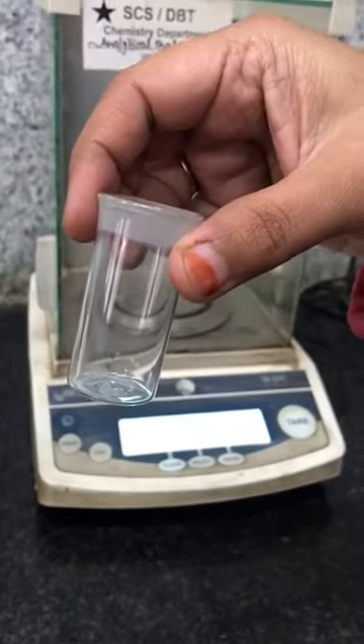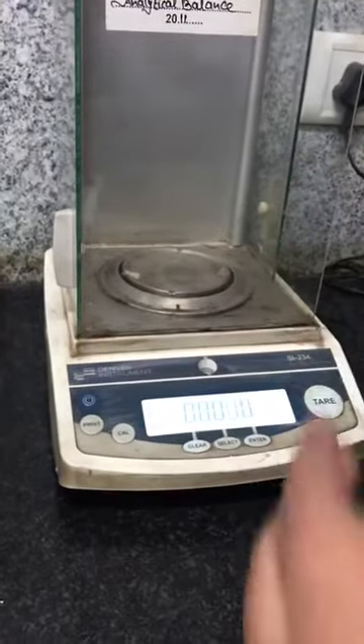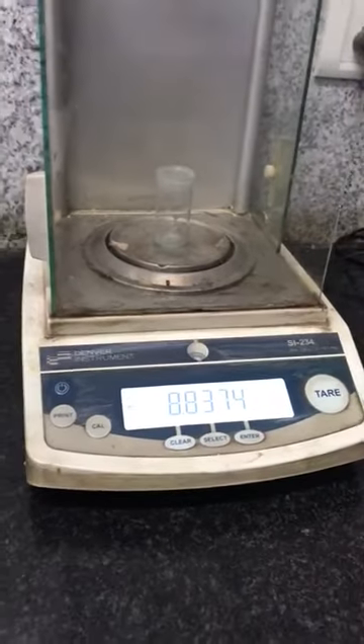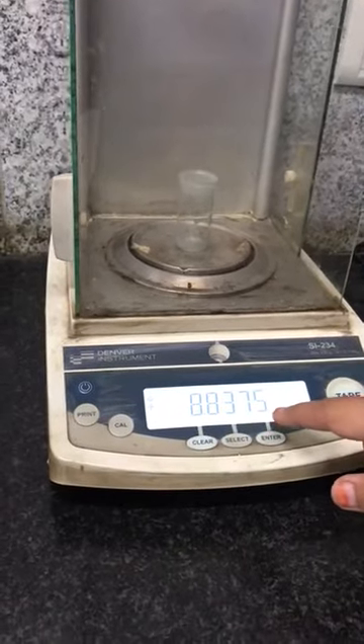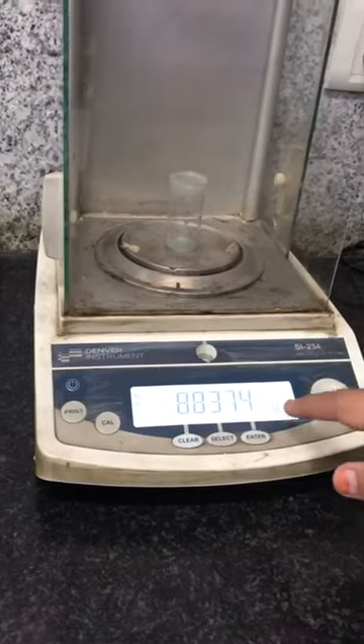Whenever you are taking any of the weighing bottles, you have to take that bottle. For initial weighing, you have to keep this bottle inside the weighing machine. Whatever weight is displayed, you have to note it down in your notebook — for example, 8.8374 grams, exactly like this.